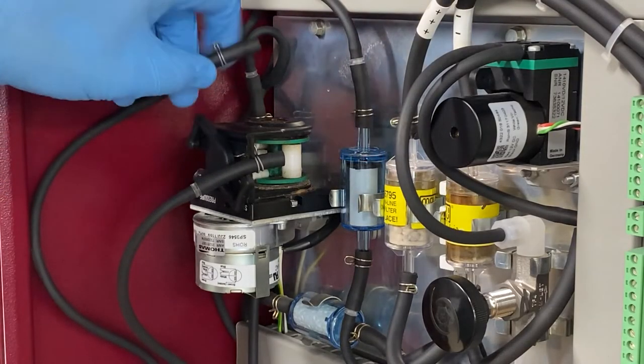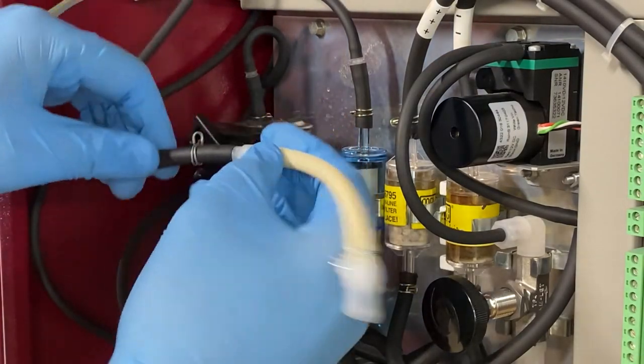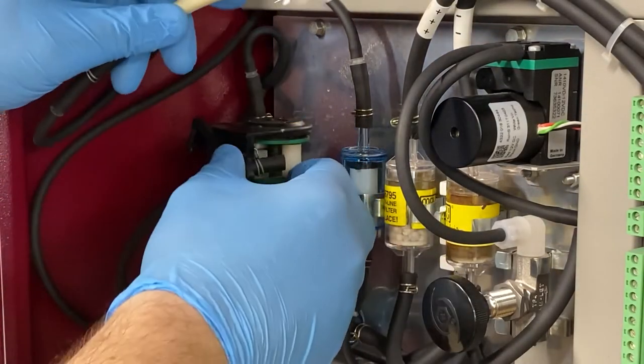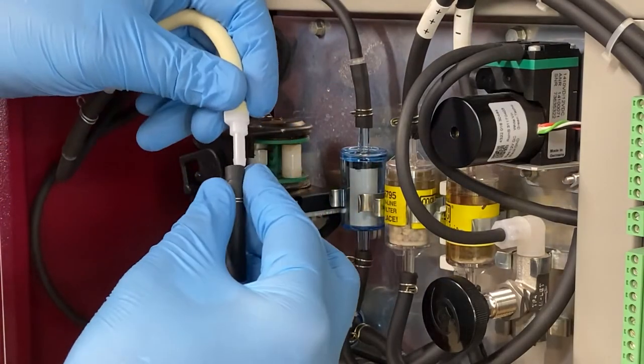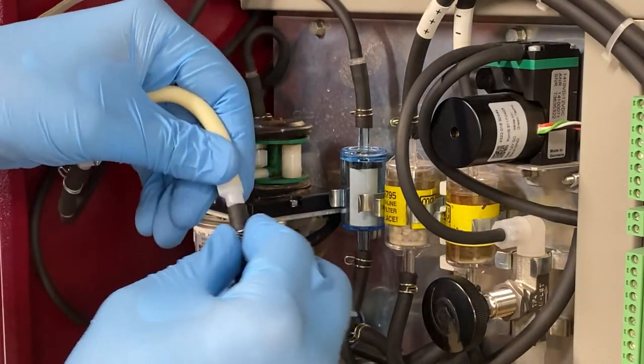To replace the condensate pump tube, first insert the ends of the new one into the condensate pump's external tubing and then re-tighten the metal clasps.